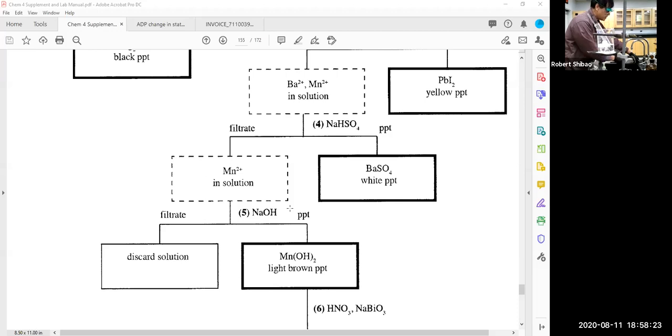These tests aren't hypersensitive. If these were hypersensitive tests, I'd be very careful in washing, because I'd have to make sure that my washes are very thorough. Otherwise, cross-contamination could yield positive test results. But these require quite a bit of precipitate, and so they're a little bit more forgiving as far as small amounts of contamination.